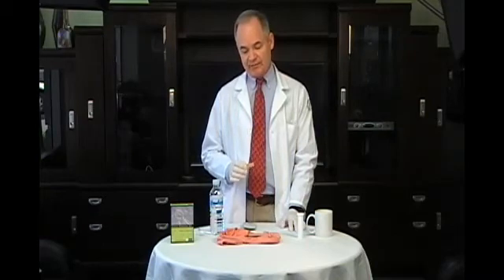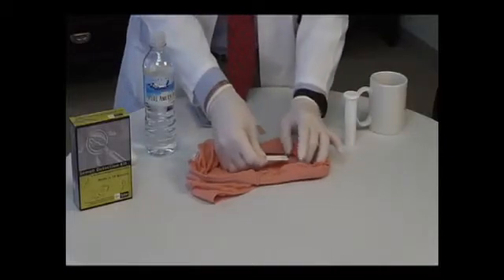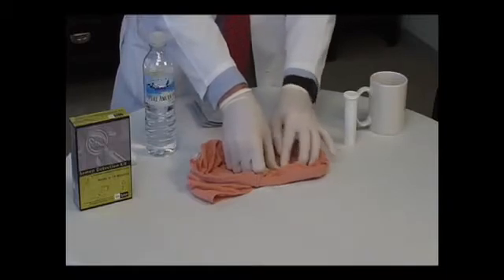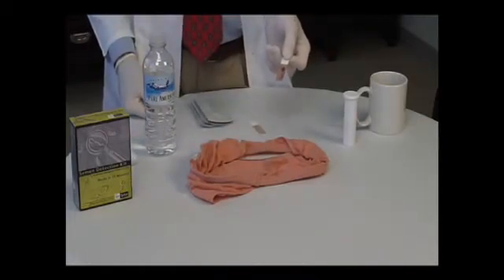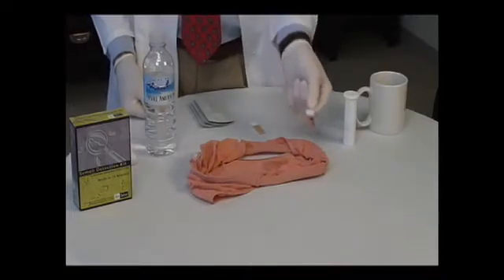Vaginal discharge does have a little bit of acid phosphatase in it, so it's important to read the test within 60 seconds to avoid a false positive test. So here we go. 1 1000, 2 1000, 3 1000, 4 1000, 5 1000. Now that's a positive test. It turned blue almost immediately. This is a strongly positive test and a presumptive test for semen.